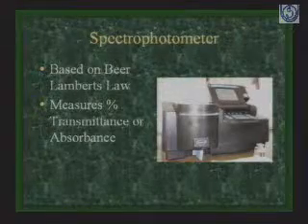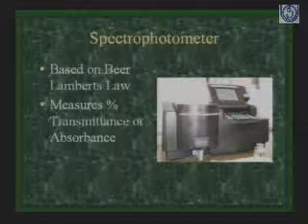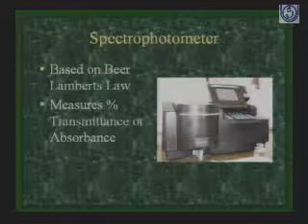And accordingly, the national and international standards are formulated. Like for example, water. If you see the color, it should be colorless. But quantitatively, the color cannot be 0. If you see the IS standard for water, IS 10500, or IS 14543 for packaged drinking water, the color should be maximum 5 Hazen units. This color can be measured by a spectrophotometer. By naked eye you cannot compare whether it has some color or not. Once there is a color, then you can say it is a color or a pale color, but it should be as per the standard.